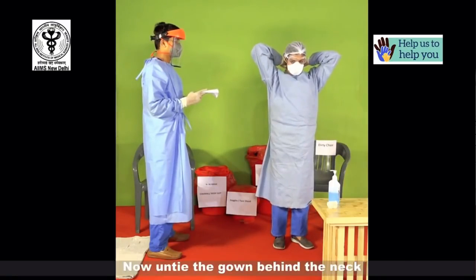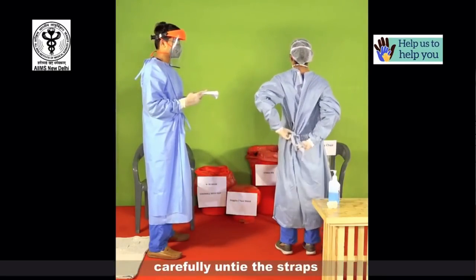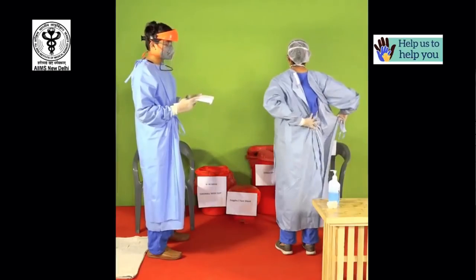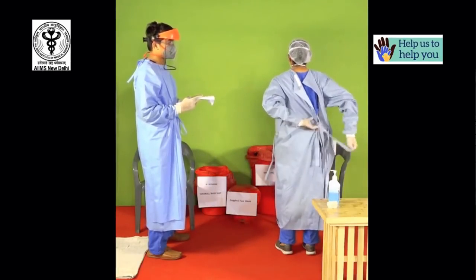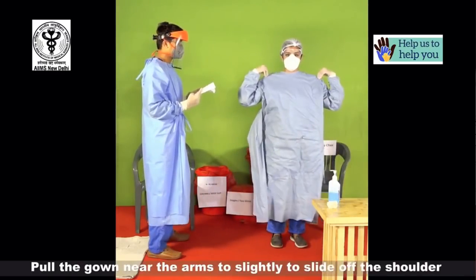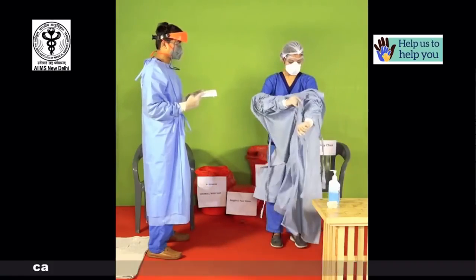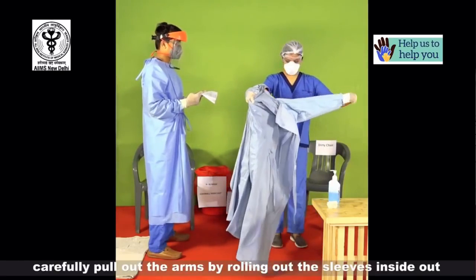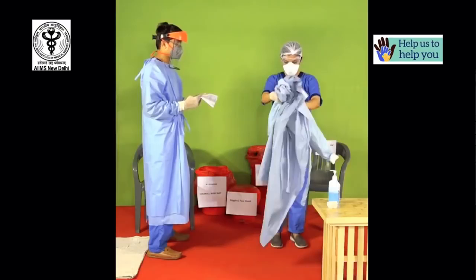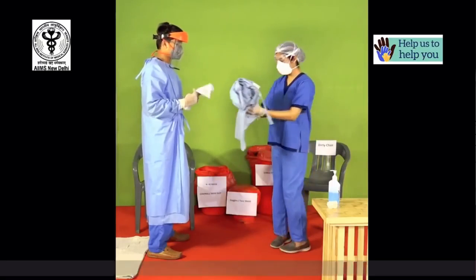Now untie the gown from behind the neck and from behind the waist. Carefully untie the straps. Pull the gown near the arms slightly to slide off the shoulder. Now pull the gown from the front of the waist. Carefully pull out the arms by rolling out the sleeves inside out. Fold or roll the gown in such a way that the contaminated surface is not exposed. Discard carefully.